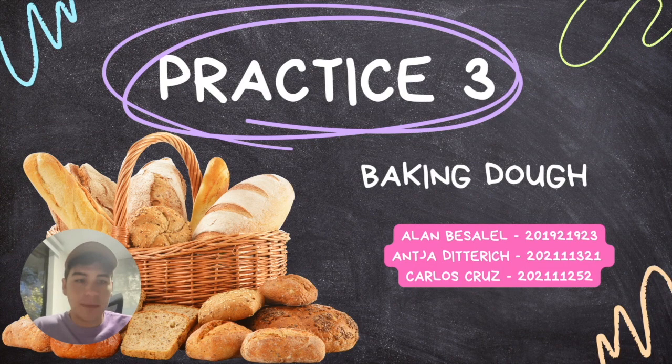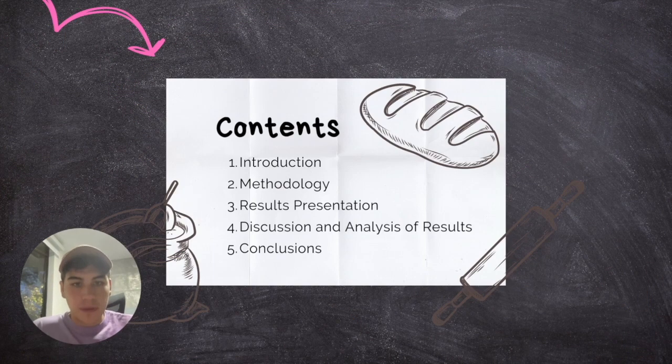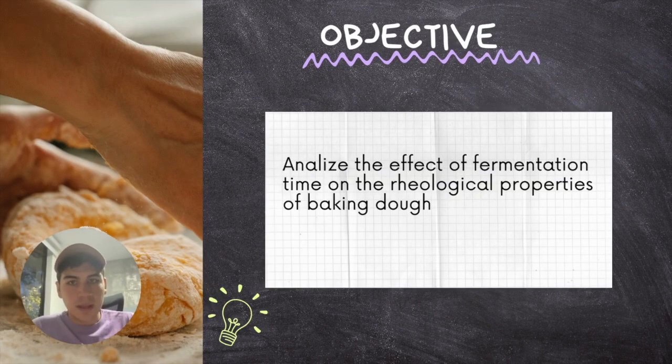Hi, this is the video for Practica3 and it's about baking dough. Its contents are first introduction, then methodology, results presentation, discussion and analysis of results, and lastly conclusions. The objective for this practice is to analyze the effect of fermentation time on the rheological properties of baking dough.